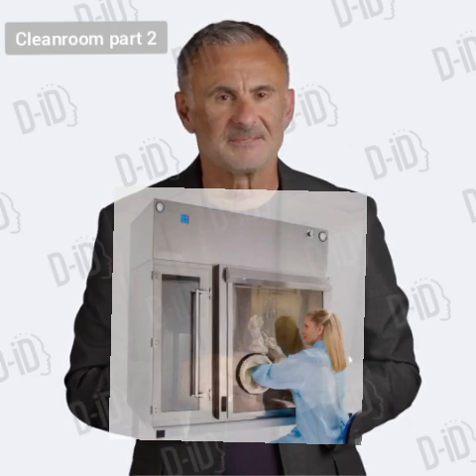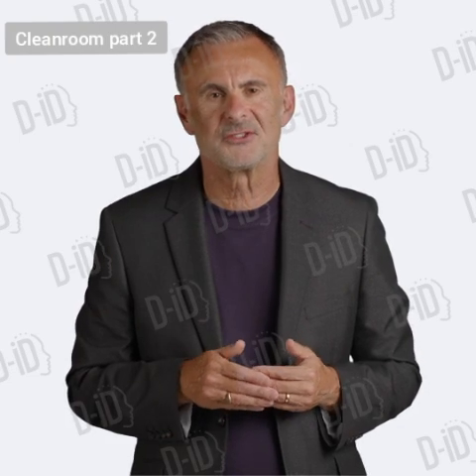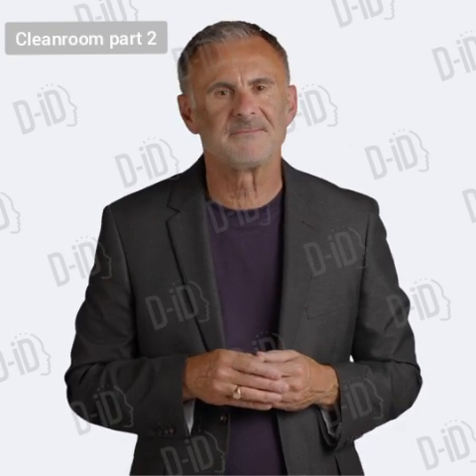LFGI provides a contained environment that allows for greater protection for both personnel and product than traditional open-front laminar flow equipment, thus is used for hazardous work with toxic chemicals or dangerous bacteria.